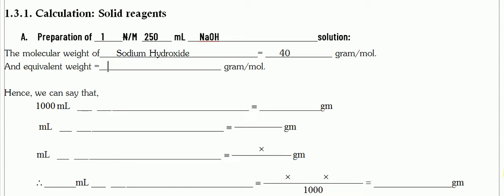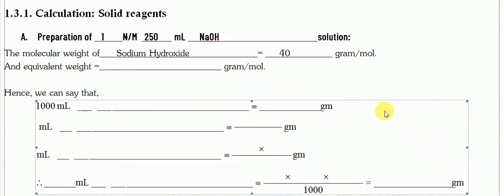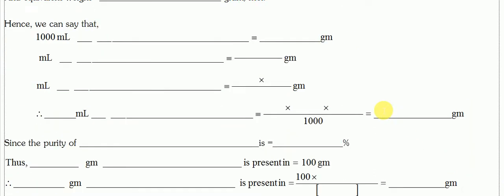Okay, now let's move on to the formula for the calculation of molarity of sodium hydroxide, and we are using one of the formulas for the calculation of molarity and normality. There are lots of formulas. We can use the traditional formula. By definition, molarity is the moles of solute divided by volume of solution in liter.